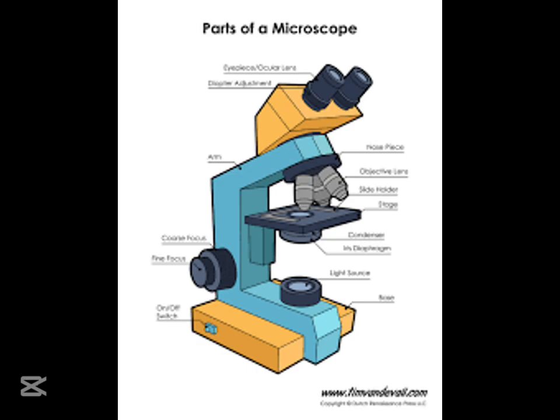We've been talking a lot about light microscopes, but are there other types? You're right, there are lots of different types of microscopes, each with its own special abilities. Light microscopes, like the ones we've been talking about, use visible light to create the image. But there are also electron microscopes. They use beams of electrons instead of light, and they can magnify things millions of times larger than light microscopes. So scientists can see even the tiniest structures within cells and molecules.